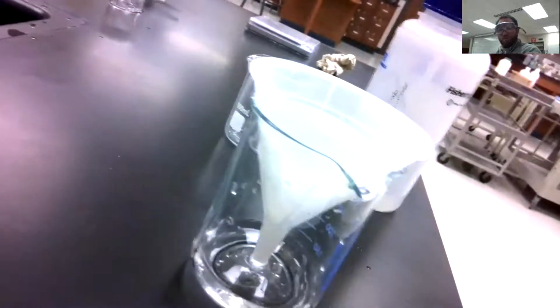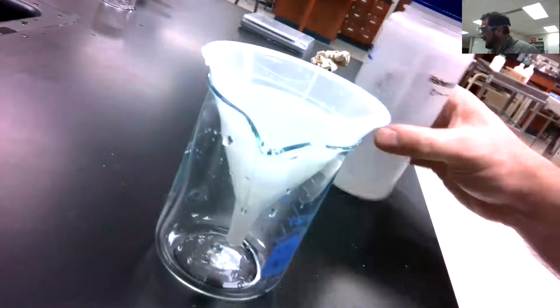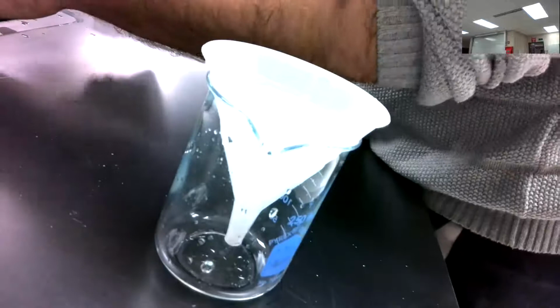So much there. Well, just a waiting game here. So just waiting and letting this drip, drip, drip. And I'm going to go ahead and dump it. A little more room here. Just a little bit left. Just the last few milliliters. And we should be good for the evening.